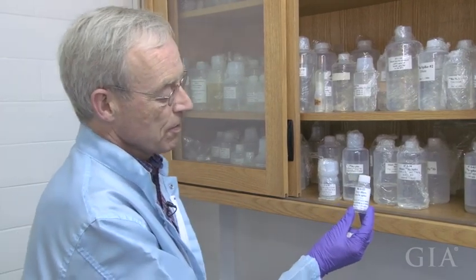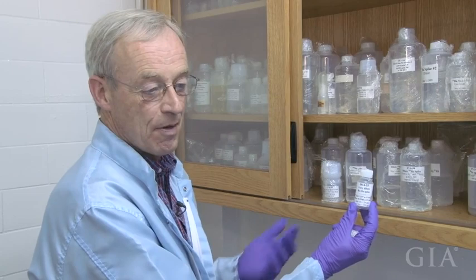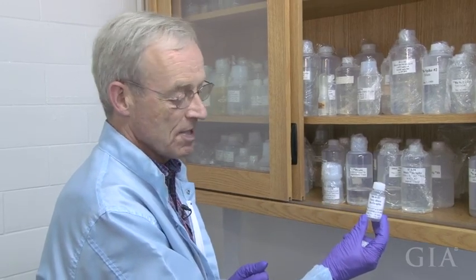This is the one we'll use for the sulfide, and we don't need very much of it, so we have a very small bottle of it. It's very dilute because the samples are very tiny.